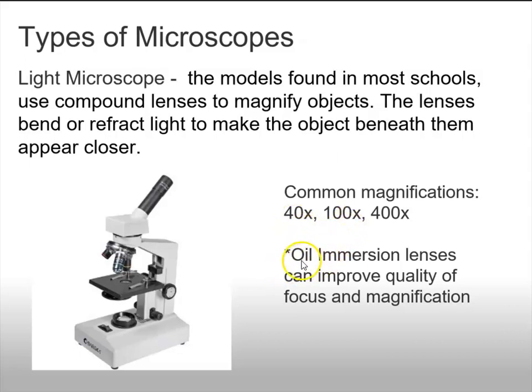Oil immersion lenses can be available. That gets the magnification power up to 1,000 times. So that's kind of the maximum of the light microscopes.